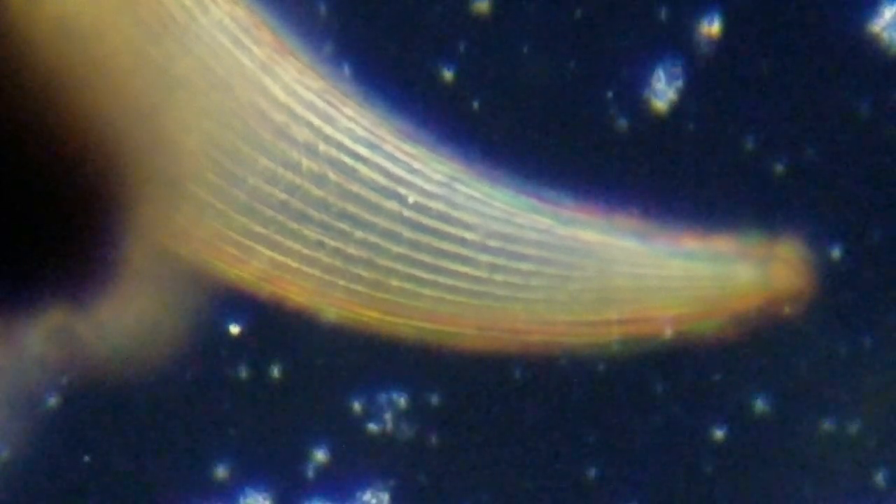I see some movement there — let's see. I'll kind of scan. You may see a little movement there, and that's on the inside. Dead center screen you can see movement there, and that's of course on the inside. Let me adjust my aperture — maybe that helps. Let me adjust my condenser. Kind of a different color there. Now dark field is great and you see the beauty of a lot of things you would never see with the white-filled light. And you see that little movement there.